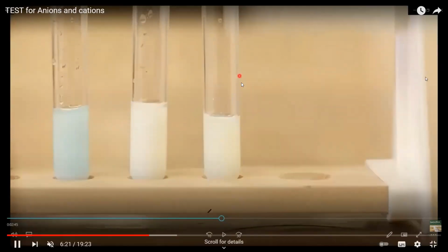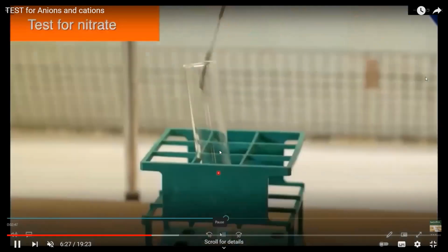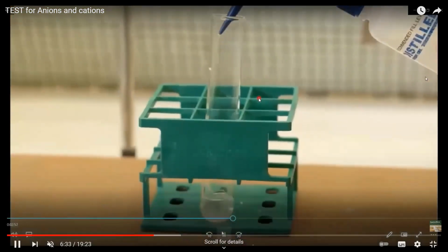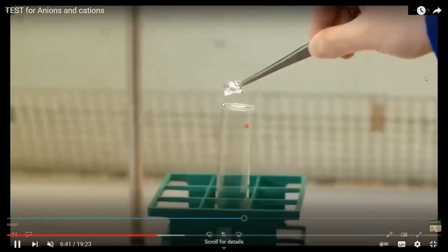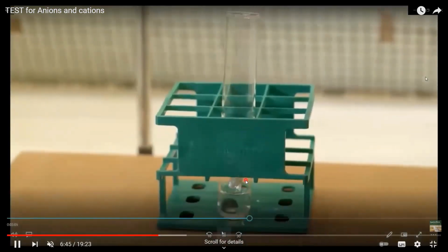Then if we want to test the nitrate ion, what we do, we have a salt solution. First, always this is done on a salt solution. So first we make a salt solution which contains a nitrate ion. We'll add sodium hydroxide and aluminium. Aluminium foil can be added. You can see aluminium foil is added here, and then we will heat.